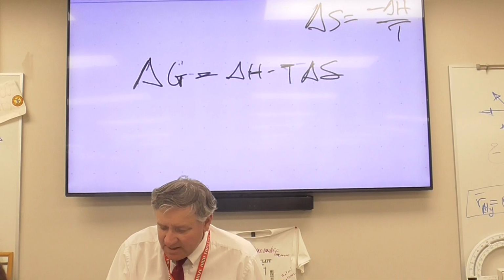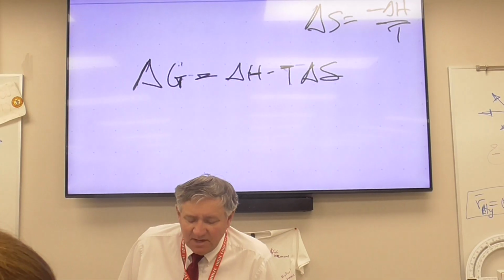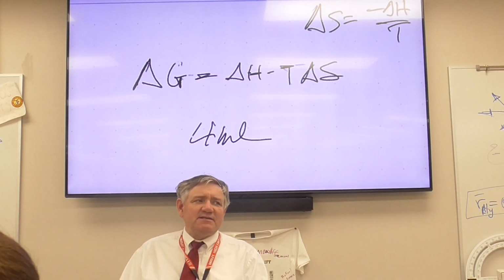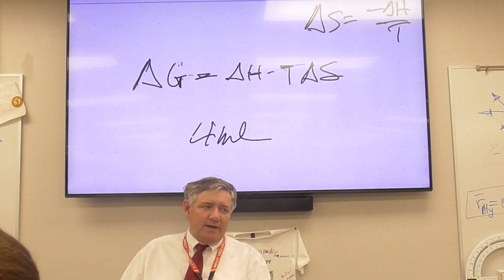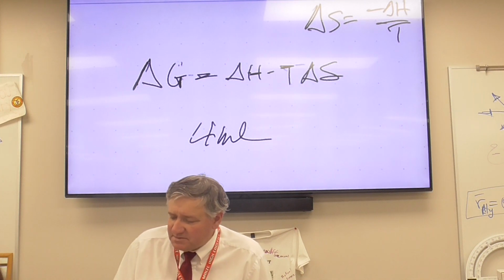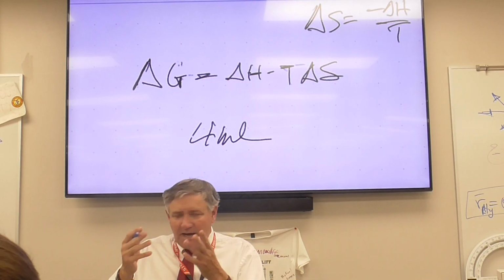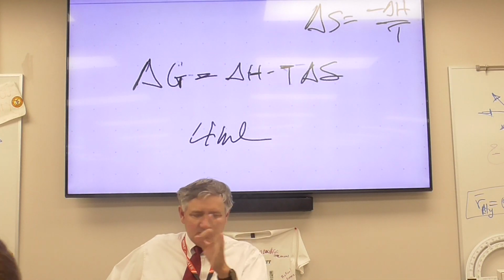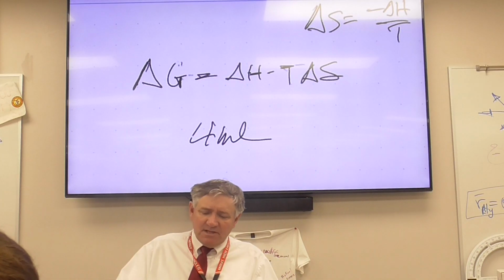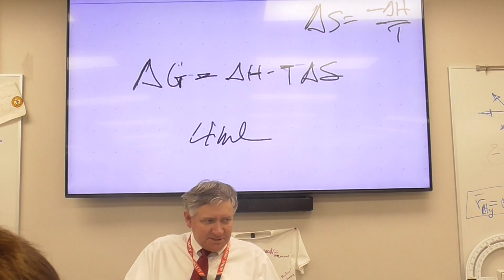Now, the nitrite and the iodide. For this one, you're going to mix about 4 milliliters. Notice that I just said 4 milliliters, okay? Notice I didn't say 4.000. Get about 4 milliliters of your sodium nitrite and about 4 milliliters of your potassium iodide. You can do that in a test tube, you can do it in a beaker, I don't care. If you're going to do it in a beaker, just use one of those 50 milliliter beakers. But you're going to mix them together. Initially, when you mix them together, nothing's going to happen, okay? The magic is going to happen.